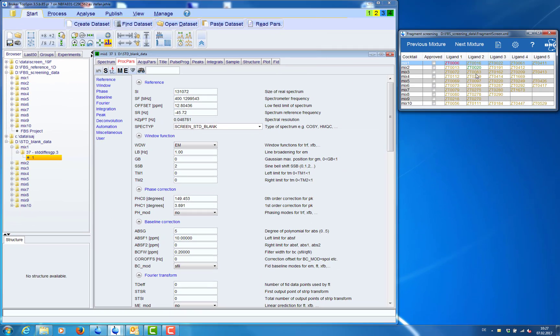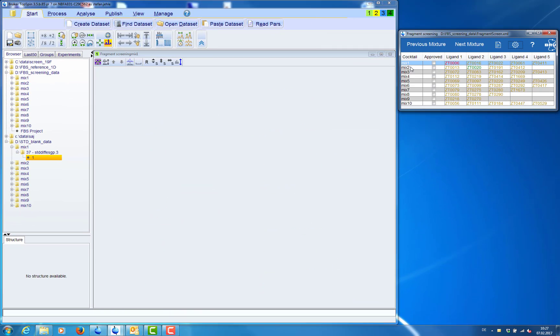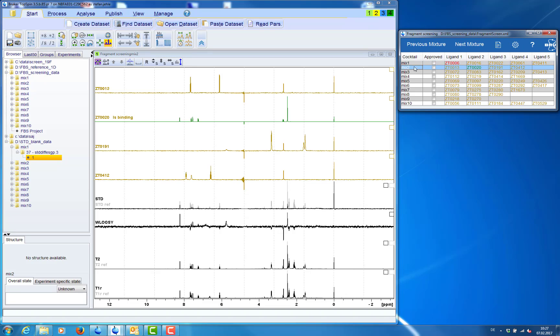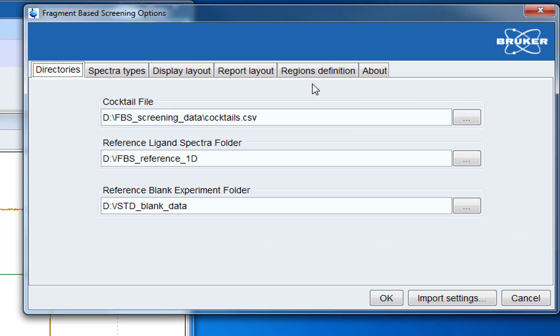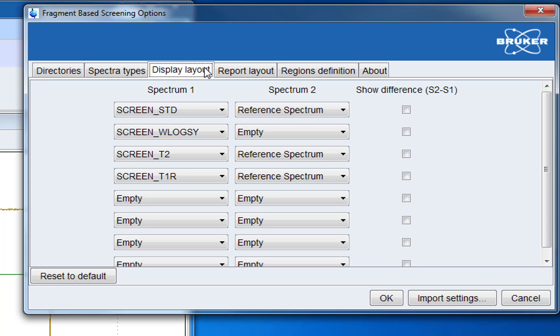After clicking OK the spectrum will not yet appear in our display. Because we also have to add it to the spectra display layout. So this is what we do now.